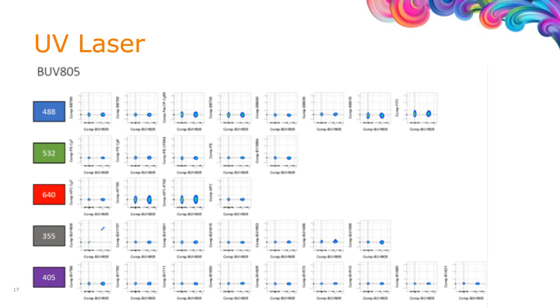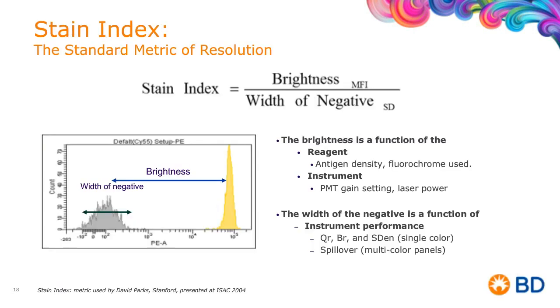Many years ago, David Parks gave us something incredibly useful, a way to examine the differences between the colors, between the brightest to the least bright. And there are stories therein of how we use those. And we all know some of those, which is, if there are lots of receptors, well, we don't tend to use one that's really bright.